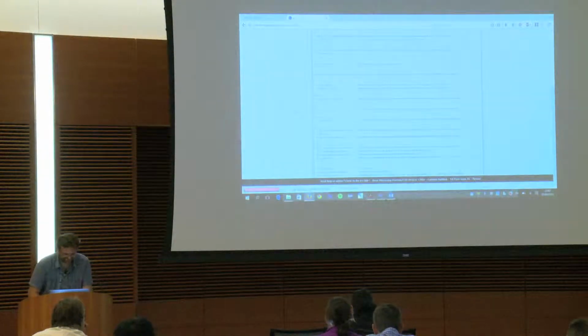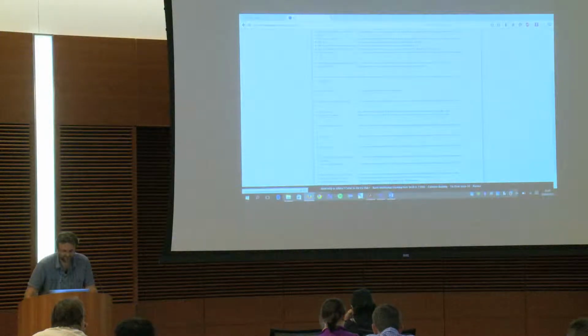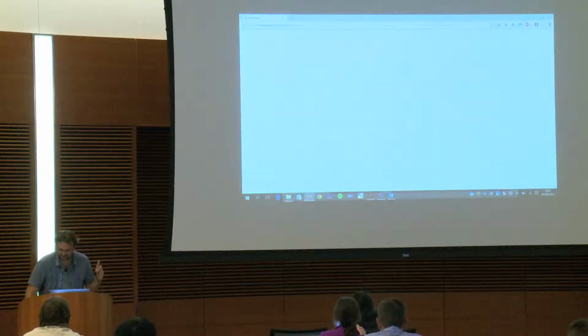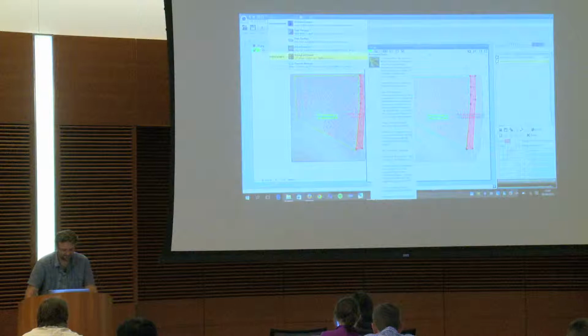Okay, it's not. I don't see examples. But if you want to, let's say, split channel, for instance. Well, you see, I can't find it on the website, but it's easier on the application. If I want to split my different channel, maybe I'm not.